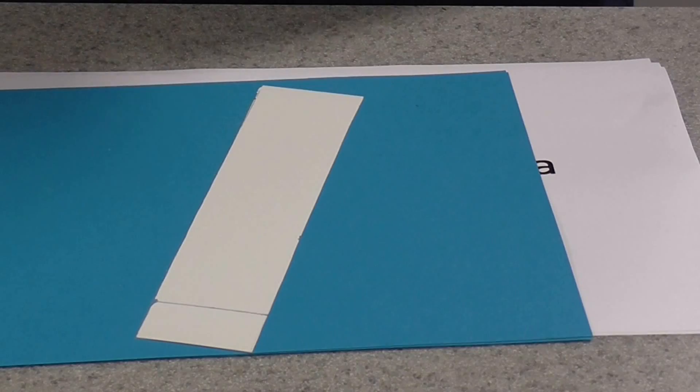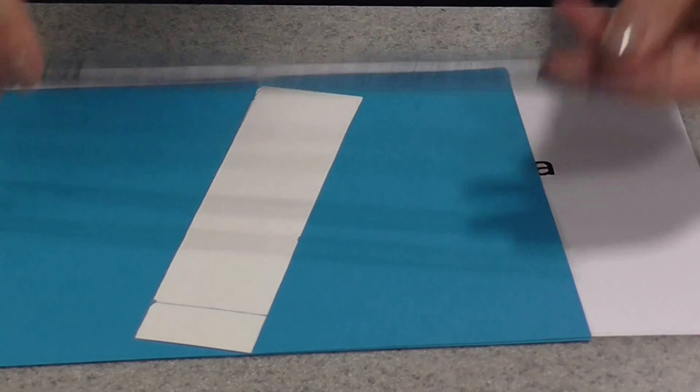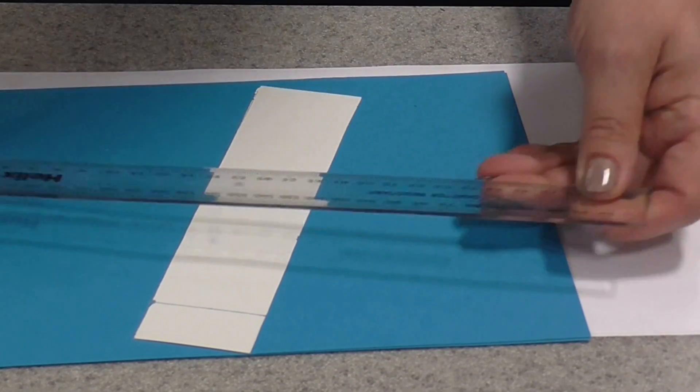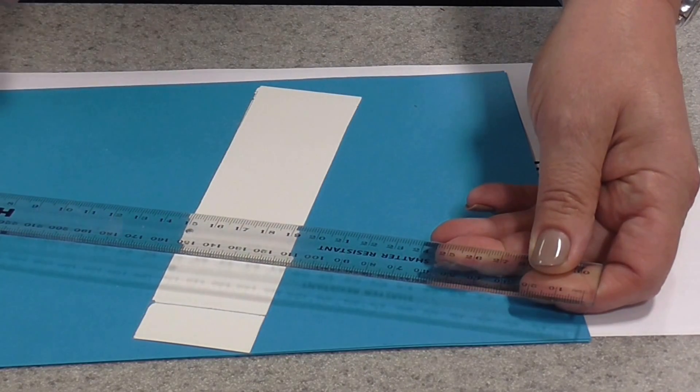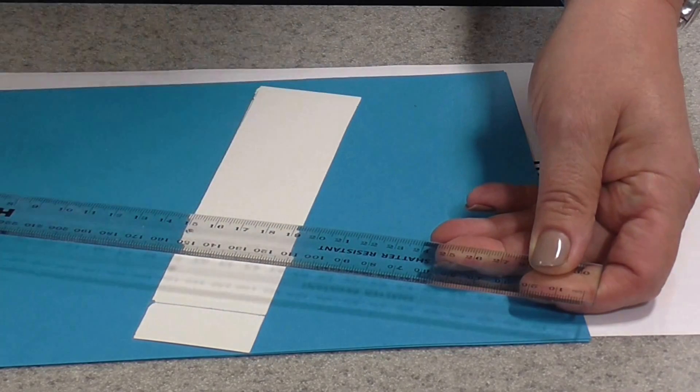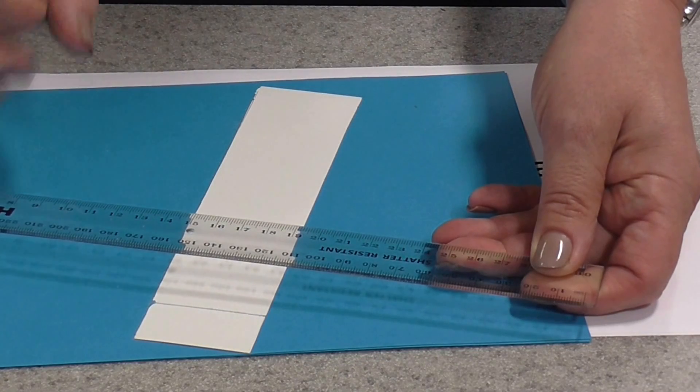Now, when you've cut your strip, the next thing you do, you get your ruler and a pencil. It must be a pencil, not a pen. And you draw yourself a line around 2 centimeters from the bottom of the strip. That will represent the origin.